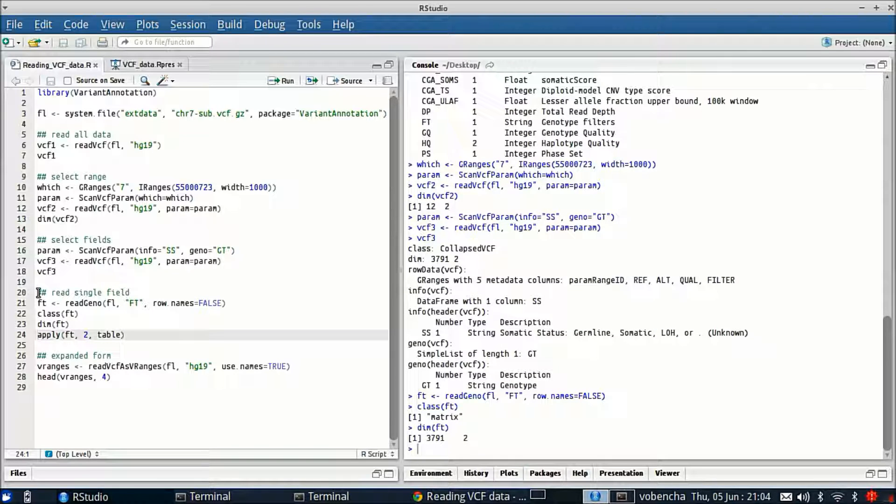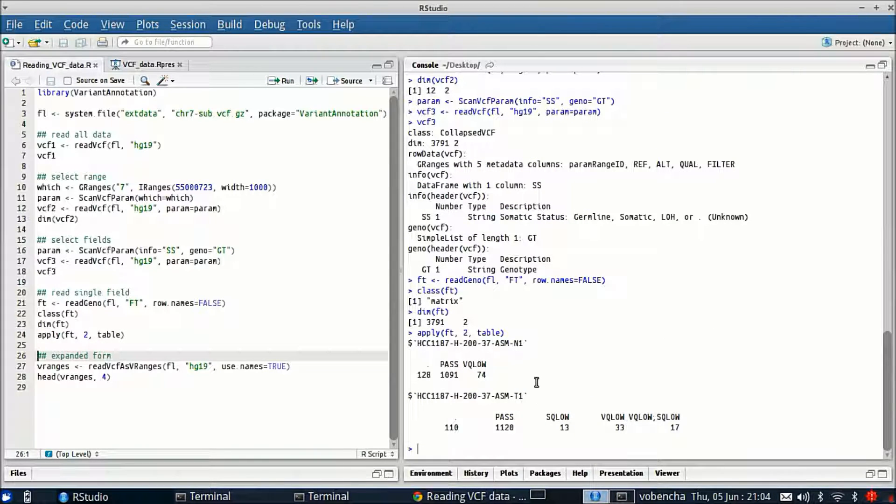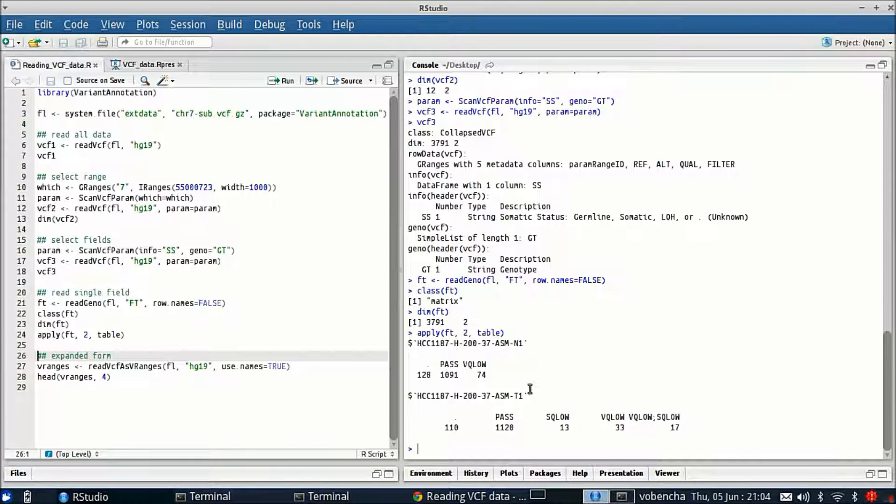As you can see it's not coming in as a VCF class, instead it's coming in as a matrix. We have our same dimensions and this apply is just a little summary for the variable for the two samples. The idea being this is a quick way to get at a specific field out of the file and do a quick computation on it.